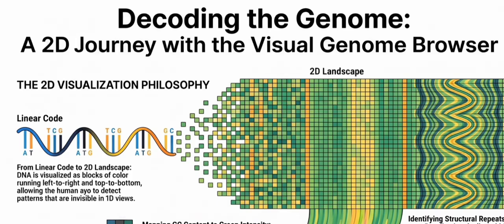So let's run with a hypothetical scenario based on that. Imagine you are researching lung cancer. You could load up the normal, healthy lung tissue data, and the software colors the genes on your map based on their standard baseline activity. Right. But then you use a threshold slider within the filter tools. You basically tell the software to hide all the genes that are behaving normally. You only allow it to light up the genes that are severely dysregulated, the ones that are cranked into overdrive or completely shut down in a tumor cell.